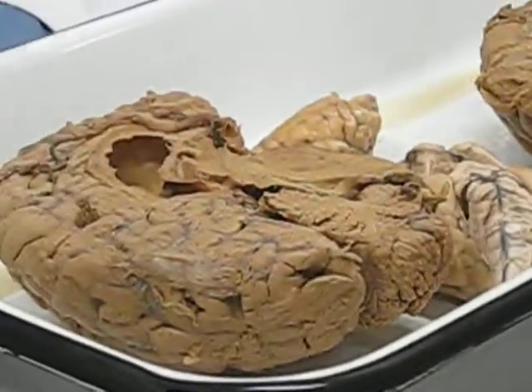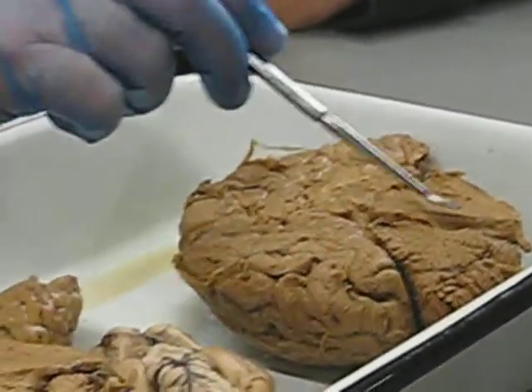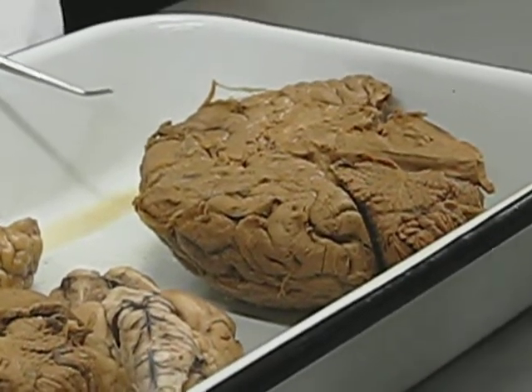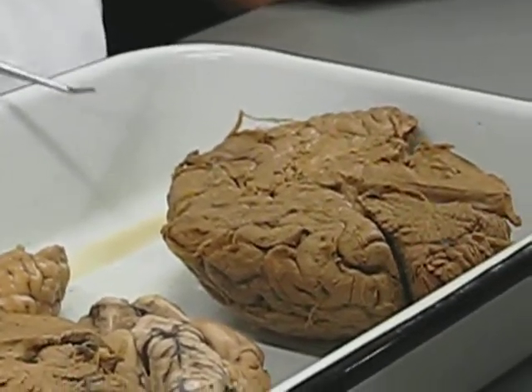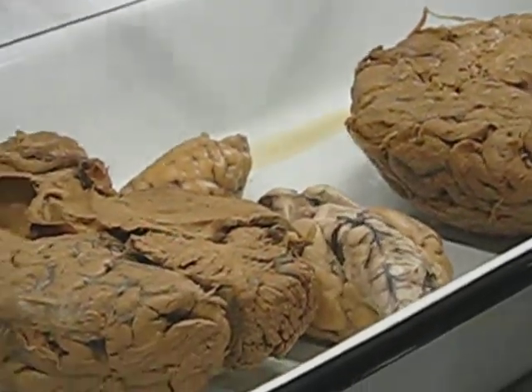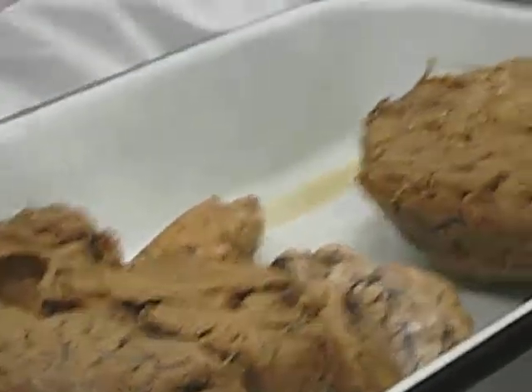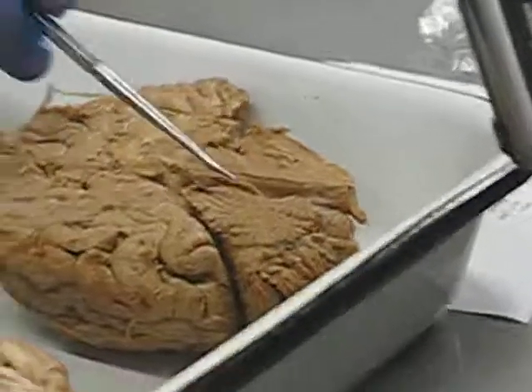The cerebral aqueduct we've looked at, and that's that right there. It connects the third ventricle with the fourth ventricle. Does it go underneath the cerebellum? It goes right through the midbrain itself. This is the midbrain right there, so it's going right through this part. It goes toward the fourth ventricle. It ends at the fourth ventricle. Here's the third ventricle. Here's the fourth ventricle, right there. So it just connects the two.